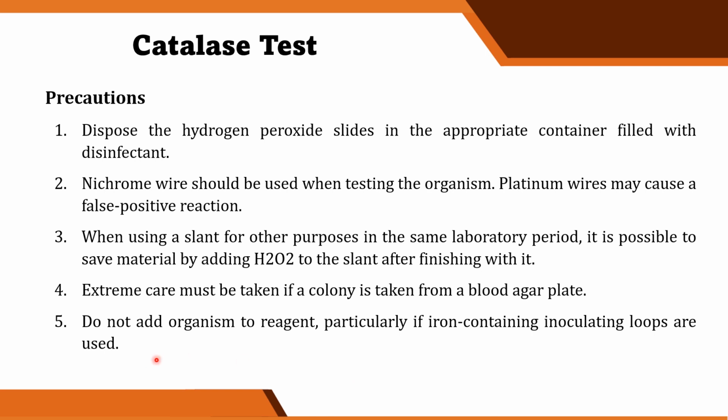Do not add organisms to the reagent, particularly if iron-containing inoculating loops are used. So it should be the other way around, right? Organism muna yung ilalagay natin sa slide, and then tsaka yung reagent. Hindi reagent muna, tsaka organism. Okay?